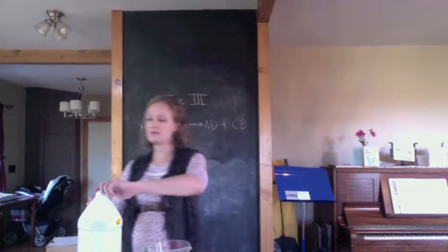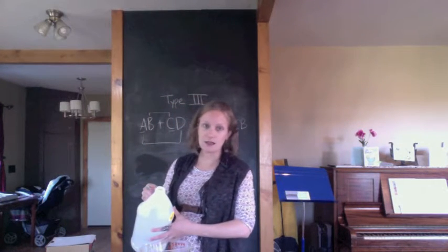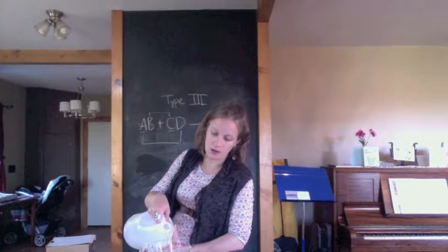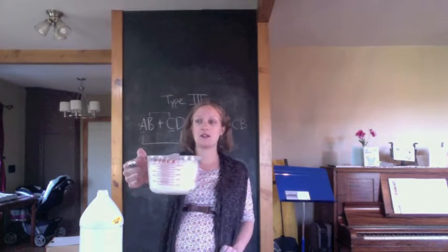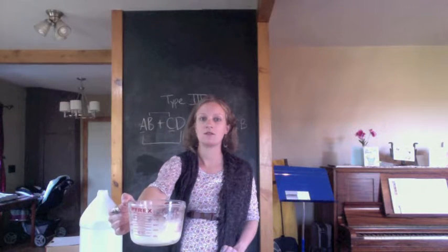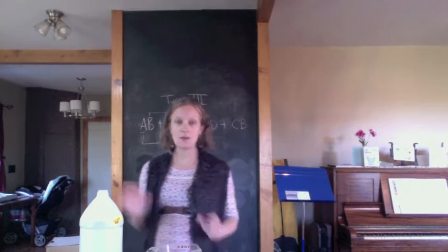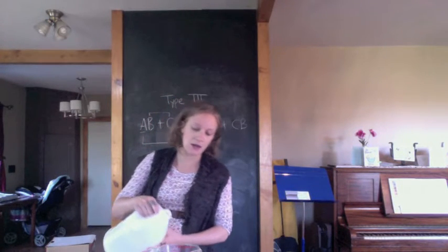So we're going to mix the acetic acid, which is vinegar, into the baking soda, and we're going to watch what happens. So immediately we see the generation of a lot of bubbles. And can you hear it? It's fizzing. It's creating carbon dioxide, and that fizzing and the bubbles, they go down eventually, but the bicarbonate I can still see on the bottom, so I can add more vinegar.